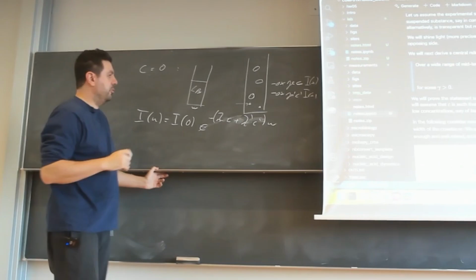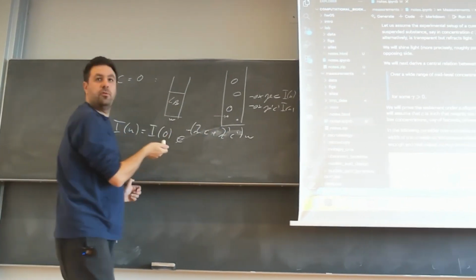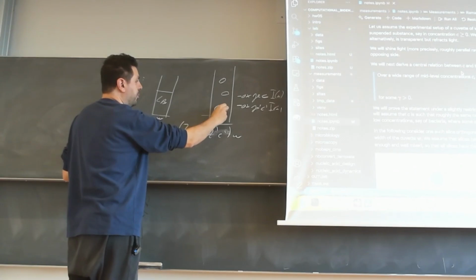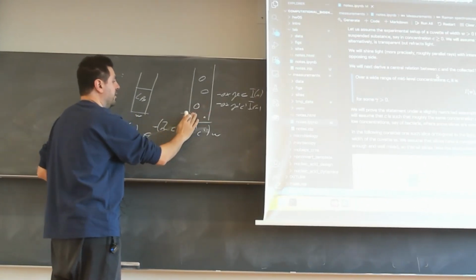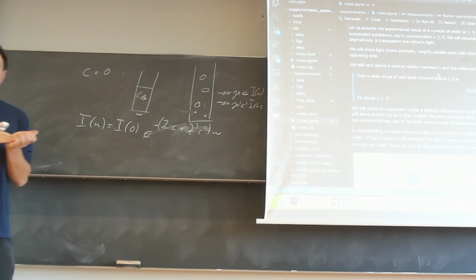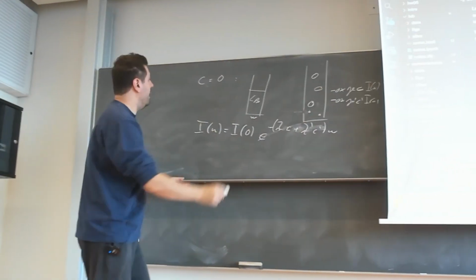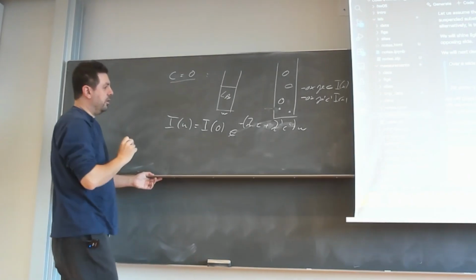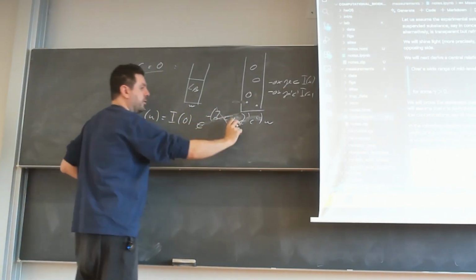And again, you have to make some little assumptions. You have to say that the sum of this concentration is not too much, or that such particles will not be hiding behind each other and so on. They're all the standard assumptions that we are in a mid-range of concentrations. Okay, and now blanking makes sense, because if you blank now, this is going to remove just this here, but it's not going to remove this.